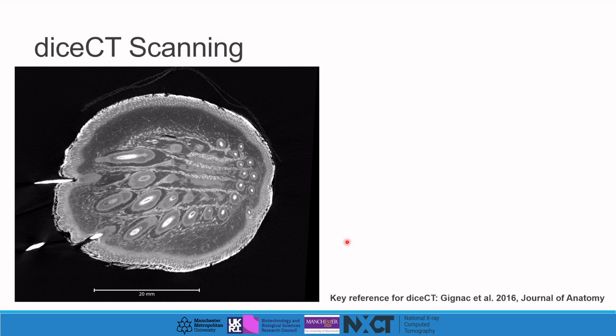Because the iodine changes the radiodensity of the tissues, we had to try other scan settings that were a much higher voltage than the unstained pads. The final settings we chose compromised on pixel size, as we could have achieved more magnification, but these data provided good contrast and low noise. However, this may mean we missed some very fine structure that was present.